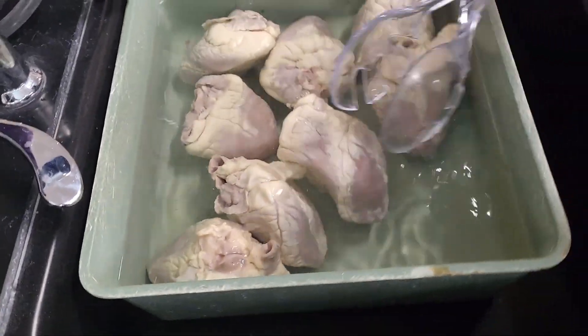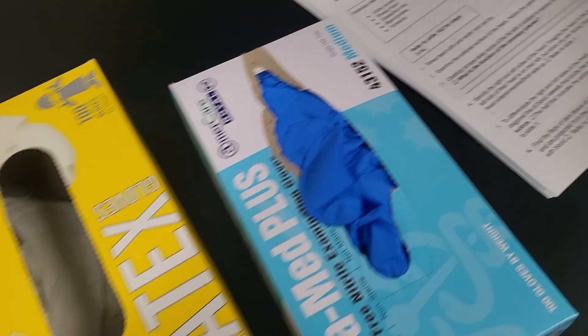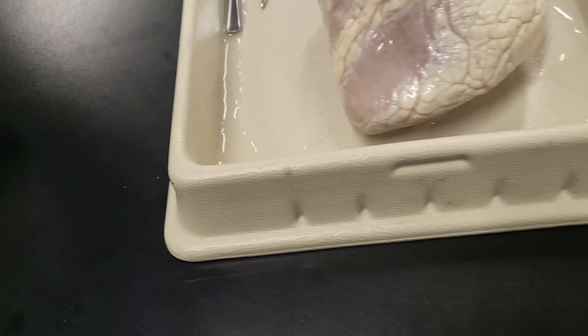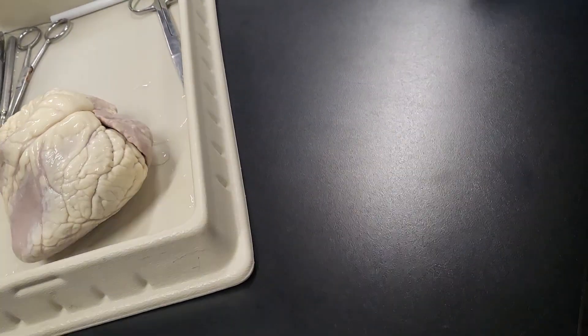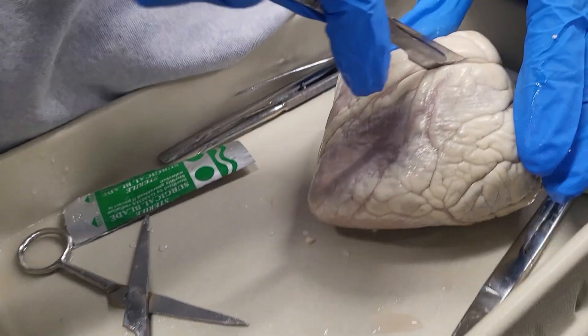Hello guys, it's Mars. Since the pig eye dissection did so well, today I'm recording a sheep heart dissection for y'all. First we had to dry off our heart, then we looked at the external structures like the aorta and arteries, and then we started to cut off fat, but we didn't cut off all the fat.